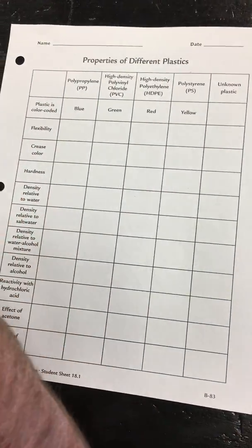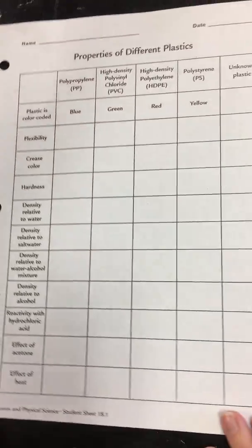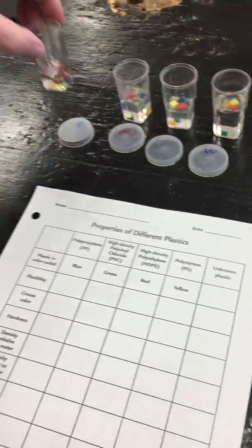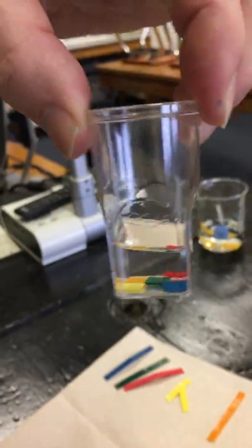Next we have our salt water. Okay, please record that into your data table. And next we have alcohol and water. Okay. And the last one we have is just alcohol.